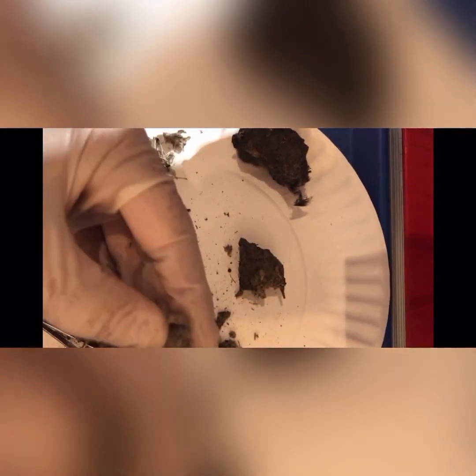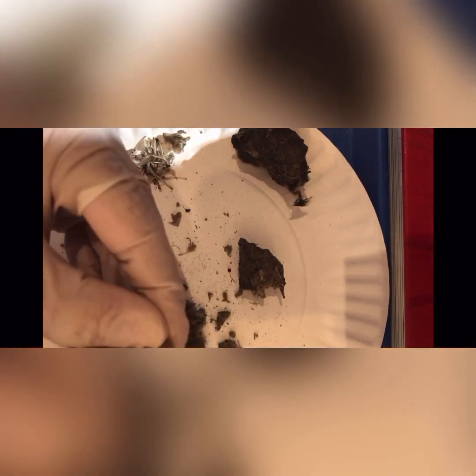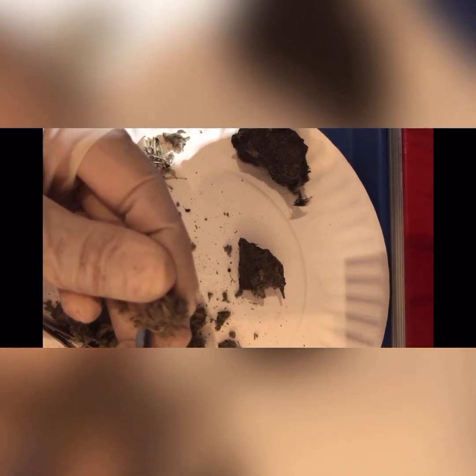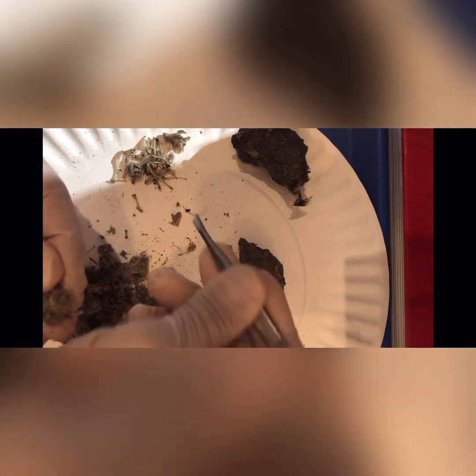So we're gonna keep just removing the fur away. And you guys see these tiny little bones? These are the actual ribs, still intact. How cool is that? Oh, I just lost something. Here's another good bone.